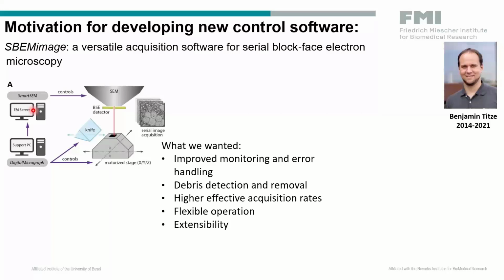We wanted to have a higher effective acquisition rate, and we wanted software that is highly flexible in operation and also very extensible, meaning it provides a platform so that the SBEM users could implement new options into that software.